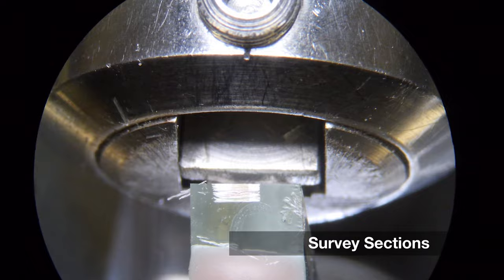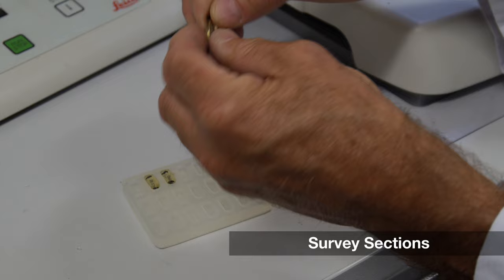As sections are cut, they float onto this water. Now that glass knives have been made, trimming and sectioning of the hardened resin block can start.